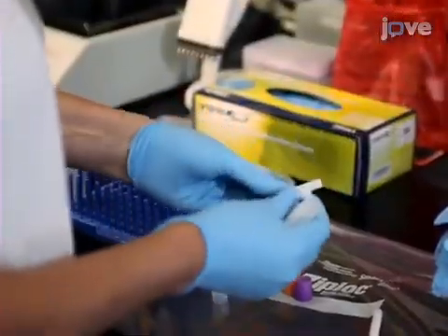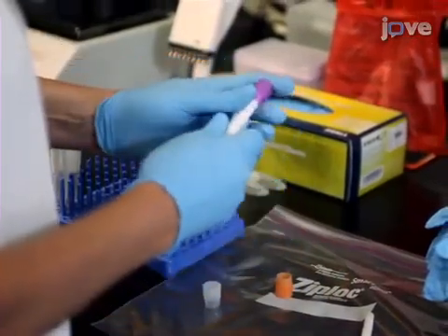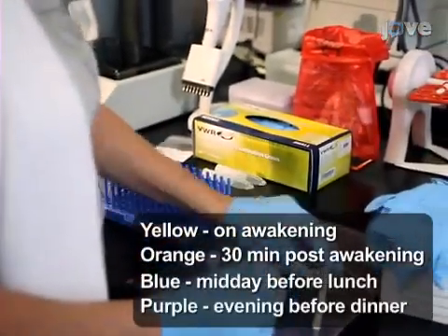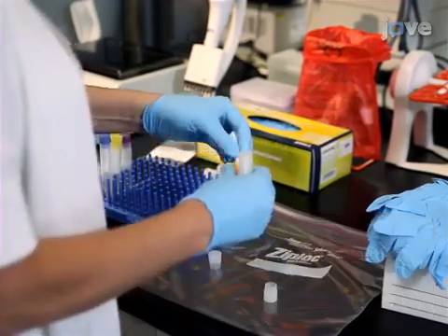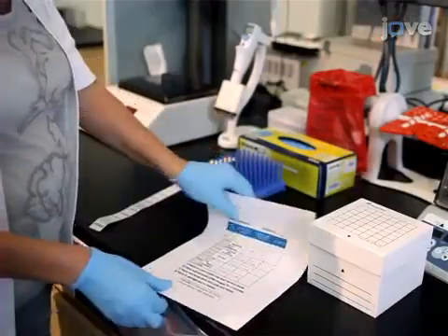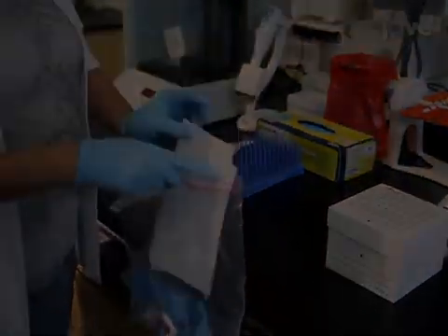Using a nitrile gloved hand, place four Salimetrics children's swabs into the four swab storage tubes and cap them with yellow, orange, blue, and purple color caps, respectively. Next, place a label on each storage tube to indicate the time of collection. Place the four capped storage tubes, the saliva collection instruction sheet, and four nitrile gloves in the Ziploc bag.